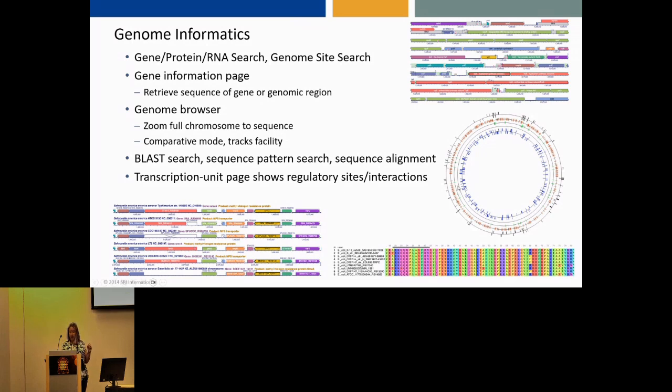This is our circular genome viewer. And we also offer a variety of sequence-based capabilities. So blast search, sequence pattern search, and multiple sequence alignment, which is shown down here.